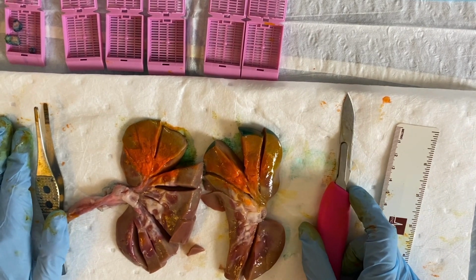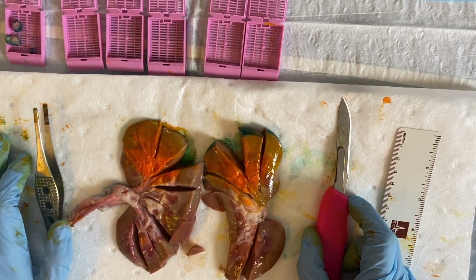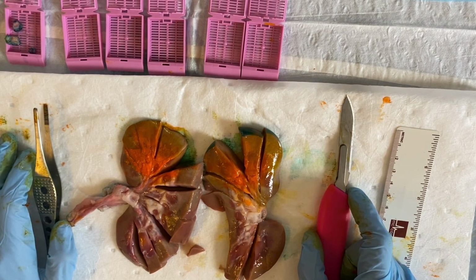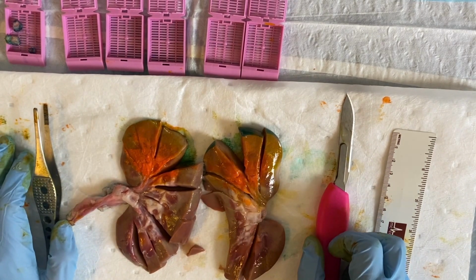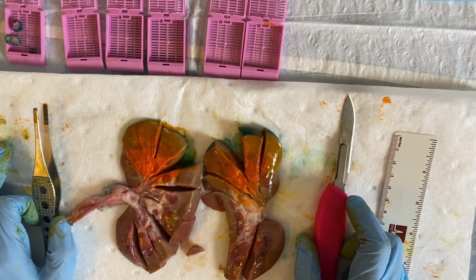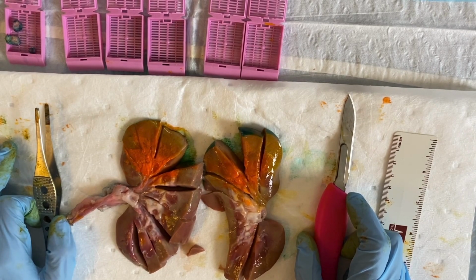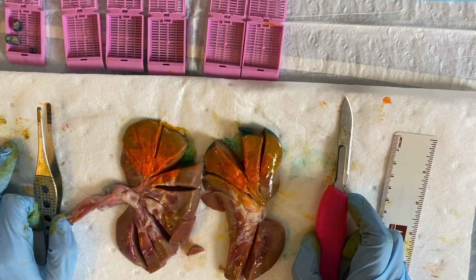Renal cell carcinomas tend to be variegated in nature, meaning that they have a variegated appearance. They may be hemorrhagic, may have areas of necrosis, and may be friable. Oftentimes it is wise, after serially sectioning a specimen in this manner, to place it in formalin and allow it to fix for a few hours at least in order to avoid contamination of your blade on various cut surfaces.